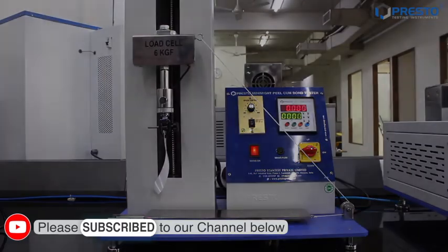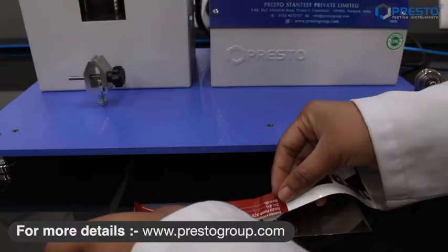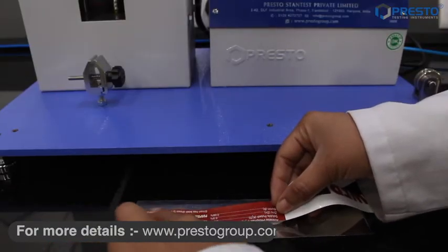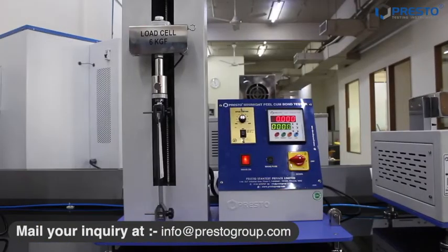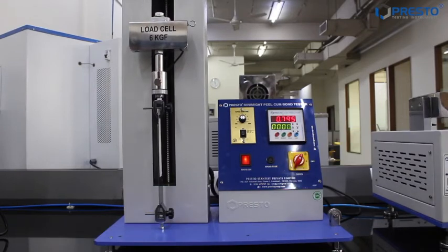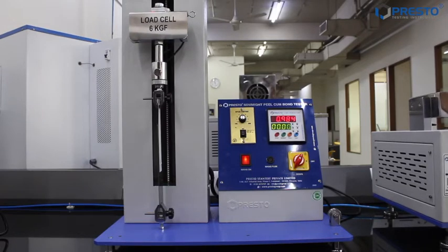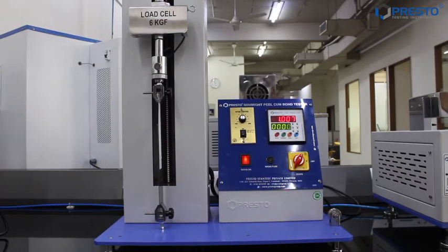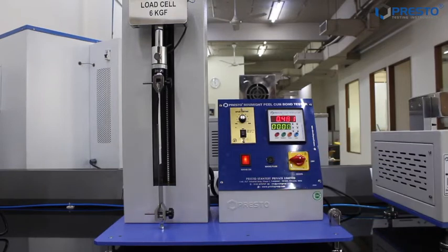Now pasting the first sample of PSP 1000 ml on the SS plate for the 180 degree test. The maximum load value is 1 kg 91 grams per 25 mm.